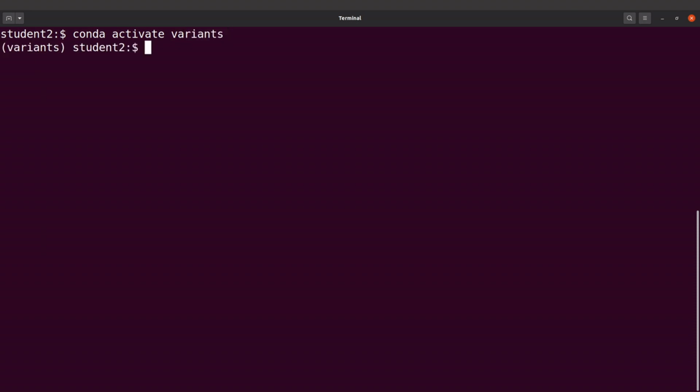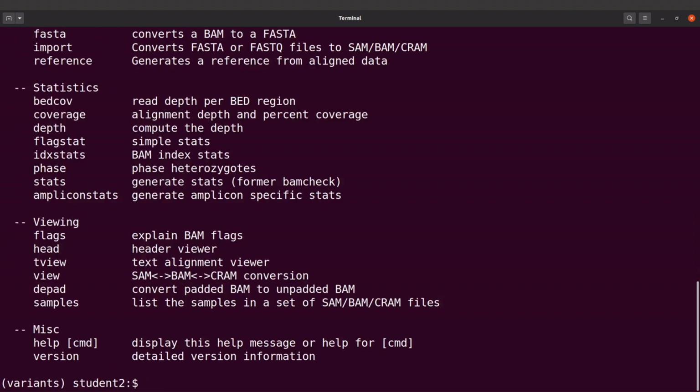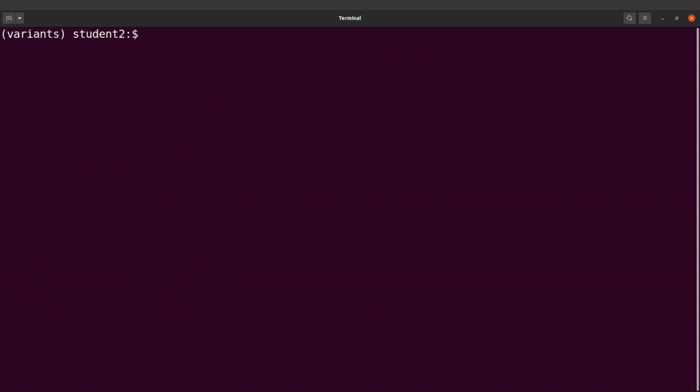And then I'll test some of the tools. Perfect. That is also done. Okay. So that's about it. I assume that the rest of the tools are also working. So we are ready to go. So let's proceed. Let's go back to the Galaxy tutorial. I mean the original tutorial, and see what is there.